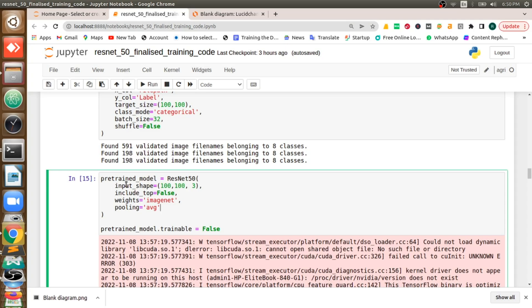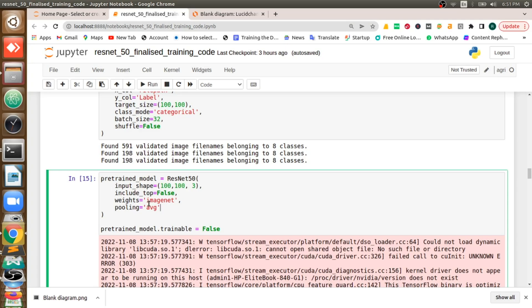Now we need to go for model building. In our case we are going to use ResNet-50 which is already trained on ImageNet. We call this process as a transfer learning. So we are going to do a transfer learning and we are going to use ResNet-50 and we are going to train it on our images.